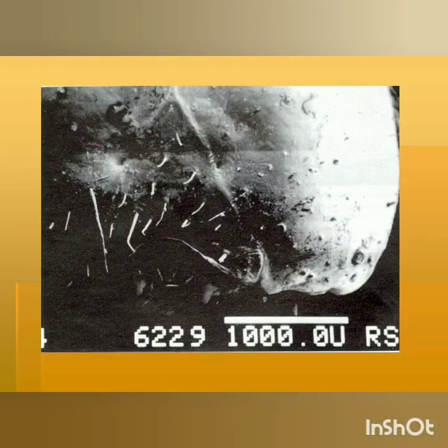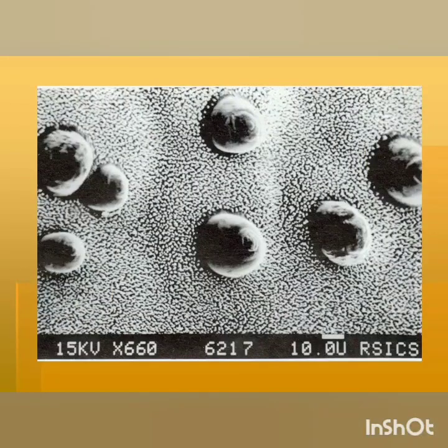In case of lower stages, we find scattered distribution of dorsal campaniform sensilla, explaining the reason for their feeding in horizontal position. This is the individual picture of the dome-shaped sensilla.